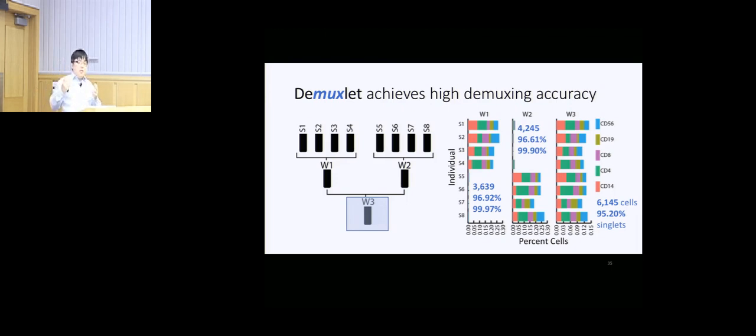That gives some idea. And basically, if you use this method with a lot more individuals and a lot fewer reads, you might have to throw out some of the reads because they're too ambiguous. But if you deeply sequence the droplet well enough, you usually should be able to get at least 50 SNP-overlapping reads, because you still have a lot of reads.